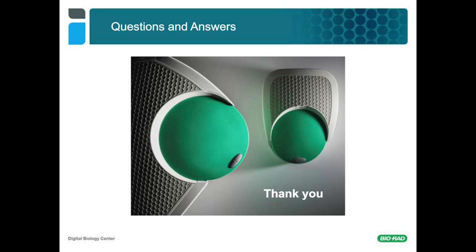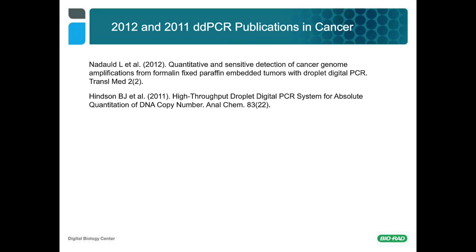And a follow-up to that, are these just probe assays, or are they primer assays available as well? Primer, EvaGreen, as well as probe assays.